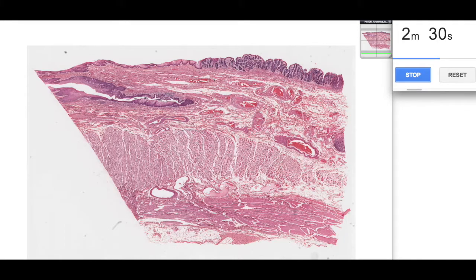Some of the other big features which we can see here are the numerous veins associated with the anal canal within the submucosa here. We know that there are some pathological conditions relating to some of these, and you can end up with things like hemorrhoids, for example, and these are abnormal veins within the anal canal.